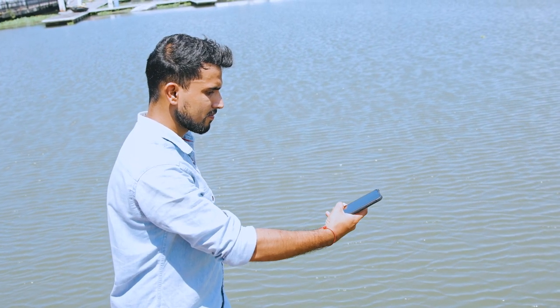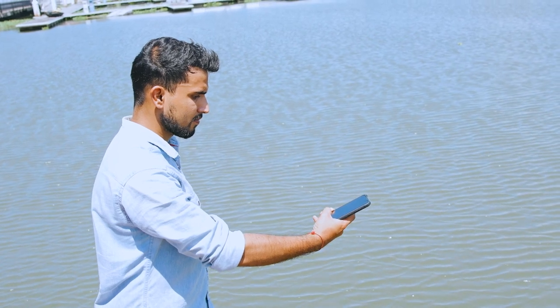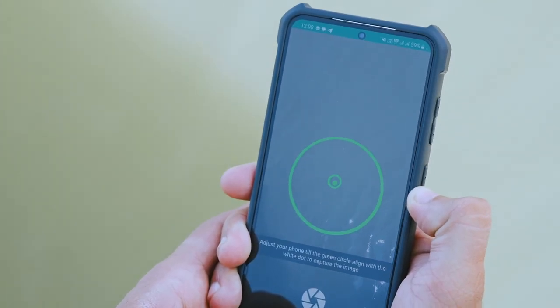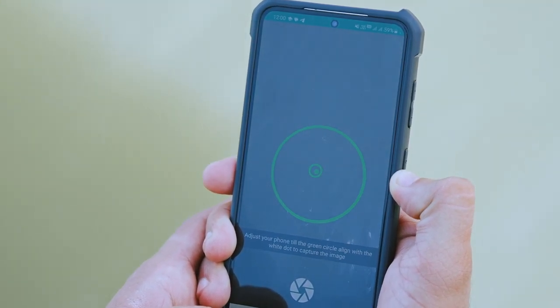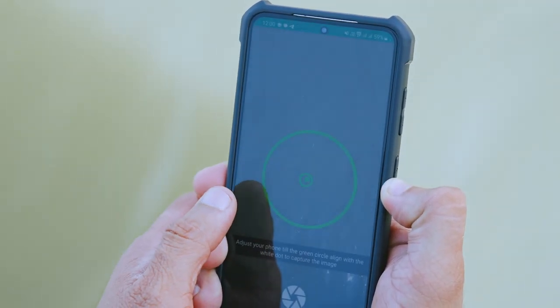Now for capturing the image, hold your phone horizontally just above the water surface. Adjust your phone until the green circle aligns with the white dot to capture the image.